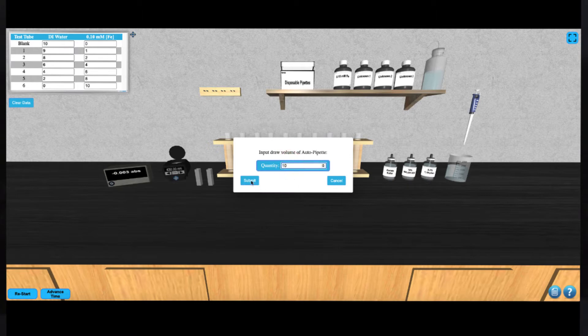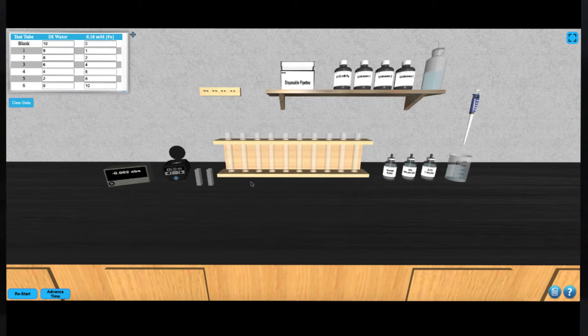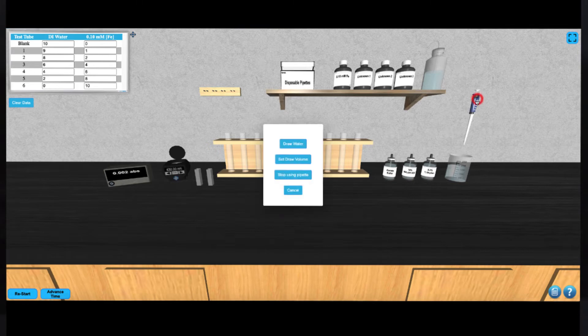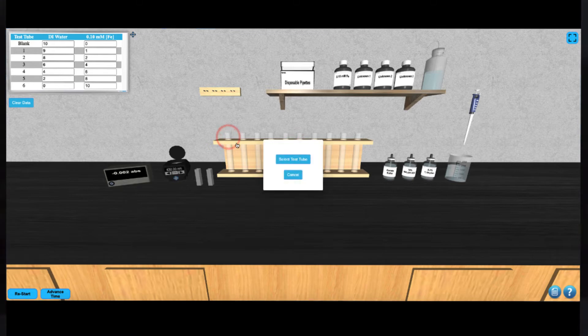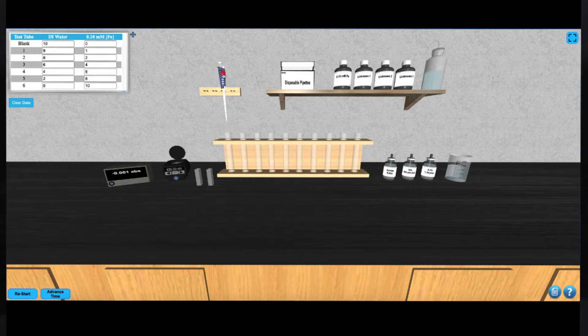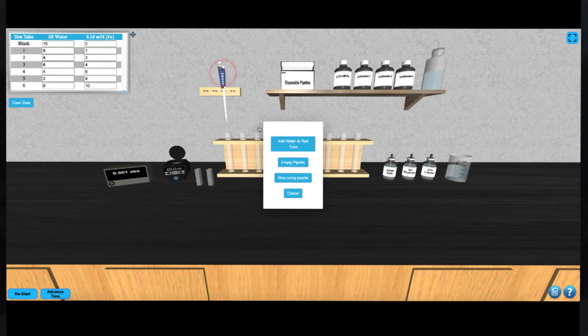Next, you can click on the solution that you'd like to draw and follow the instructions to draw up the solution. Click on the desired test tube and the pipette will move to that tube. Then you can click on the pipette to dispense your solution.